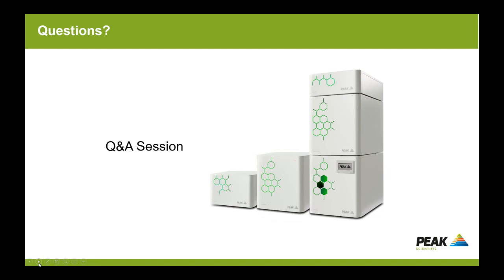But if we were to consider a typical laboratory with a total volume of around 50 cubic meters, there's a threshold which is called the lower explosion level, and to reach this you need 4% of the total volume of your lab to be filled with hydrogen. So if we had 50 cubic meters, we would need just over 2,000 litres of gas. So if we are emitting only a couple of hundred cc's per minute, so that's 1/5 of a litre, I would say that the risk is very low in having a significant buildup within your laboratory. So normally we wouldn't expect there to be any significant risk of this amount of hydrogen being released.